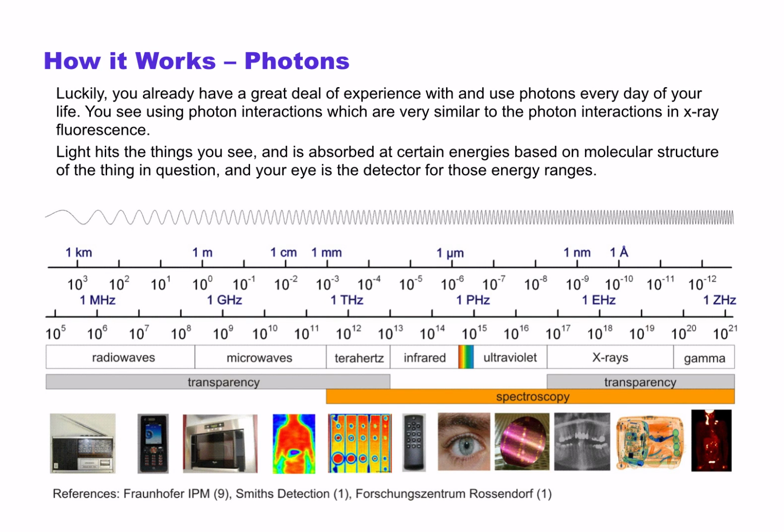Now, you have a lot of experience with all kinds of photons. Do you listen to the radio when you're driving to work in the car? Well, those are photons, pretty large photons with a large wavelength. Visible light is a narrow range, while infrared and ultraviolet are much larger. X-ray fluorescence simply interacts with a different area of wavelength as well. But as we discussed, a wavelength is not strictly speaking possible. It's just a model for understanding this. But these numbers are meaningful.